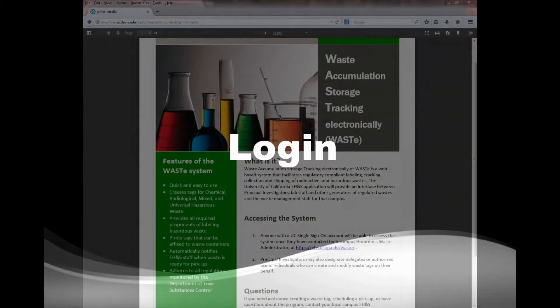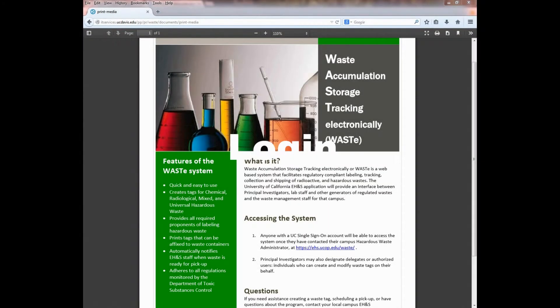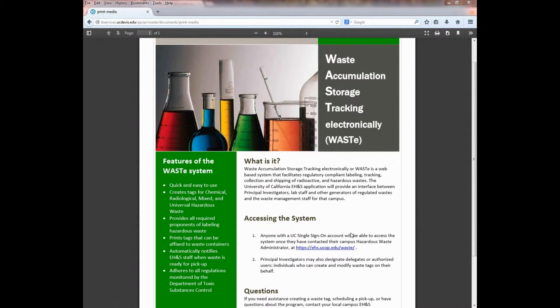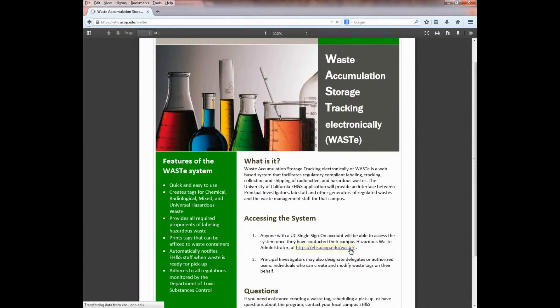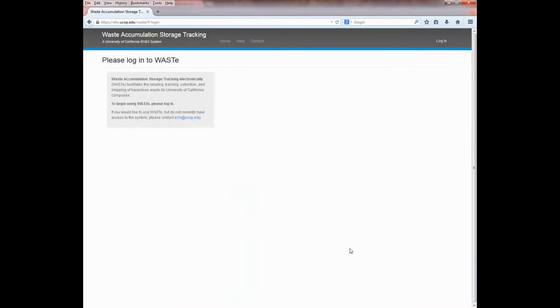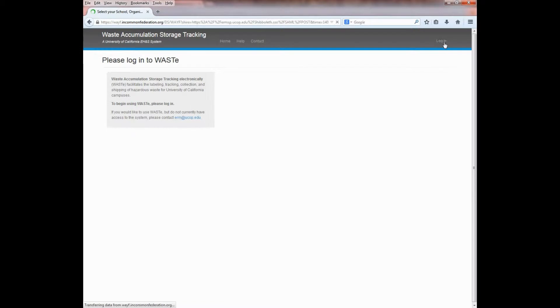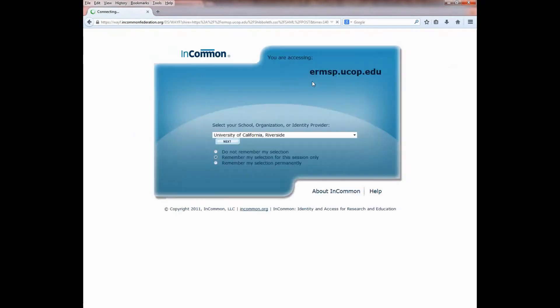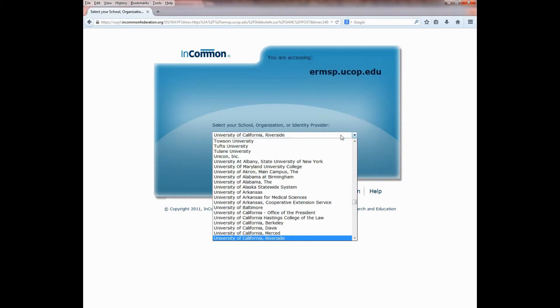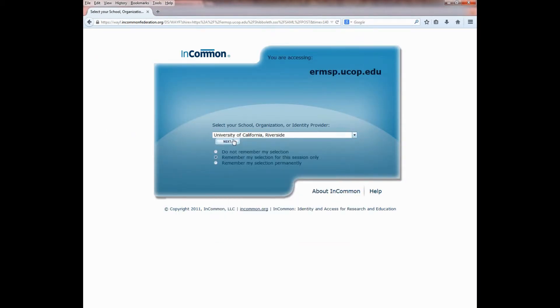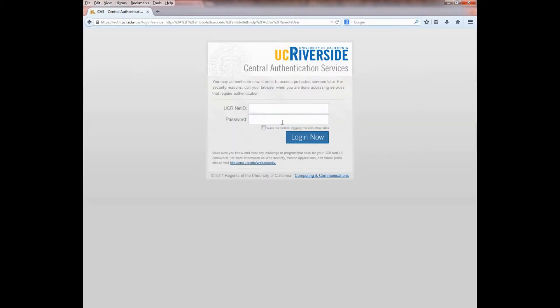To begin using the UC Waste Accumulation Storage Tracking electronically, or Waste, go to ehs.ucop.edu/waste. Then click on Login in the upper right-hand corner. Select your campus from the drop-down menu and then click on Next. When prompted, enter your UC NetID and password to log in.